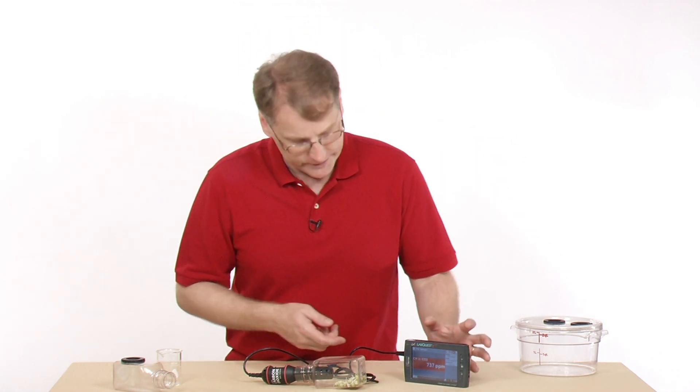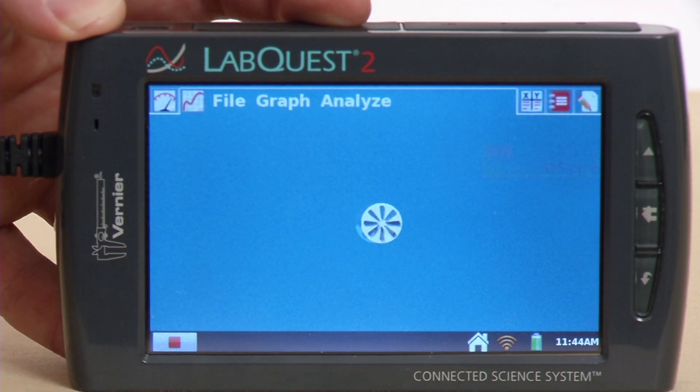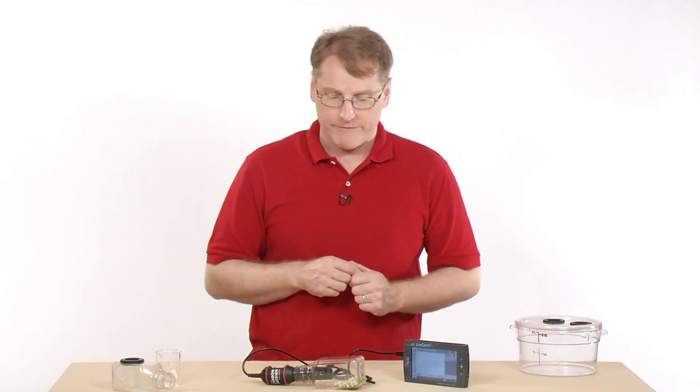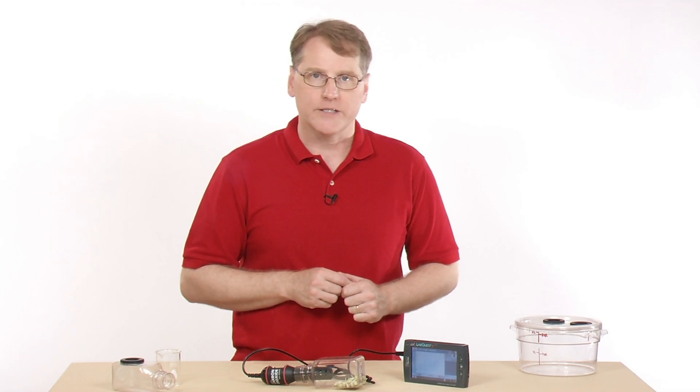Once we've set this up, we're ready to collect the data. To begin collection, all we need to do is press the Collect button. It's now going to collect for 10 minutes and we'll watch what happens to the concentration of CO2 gas in the container.